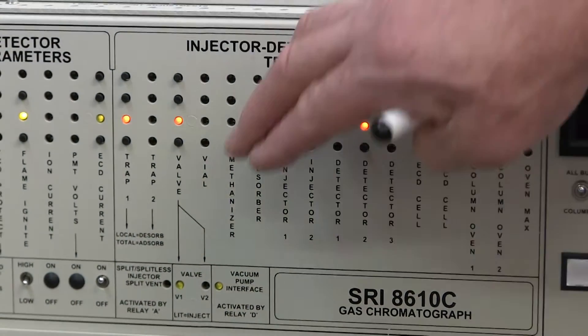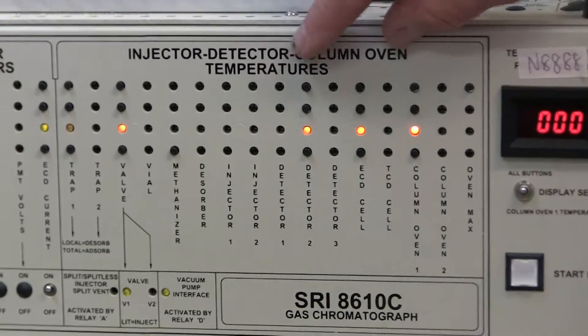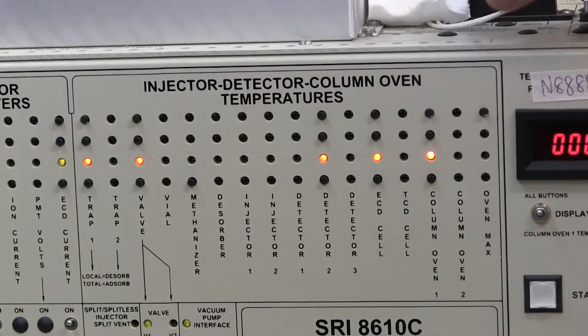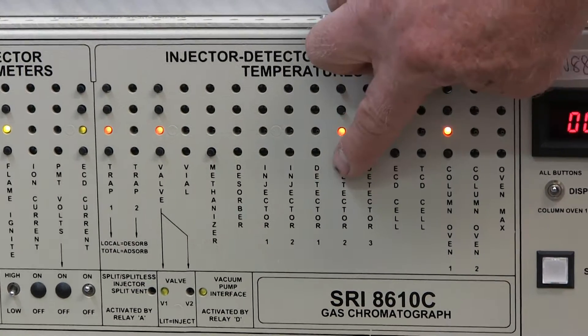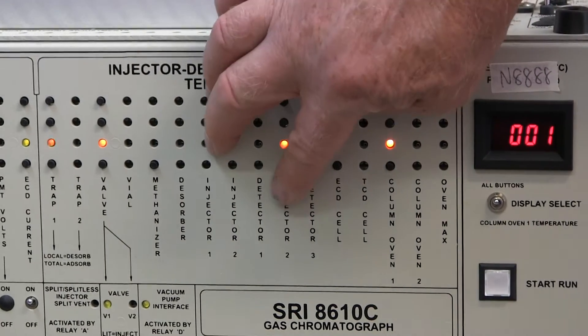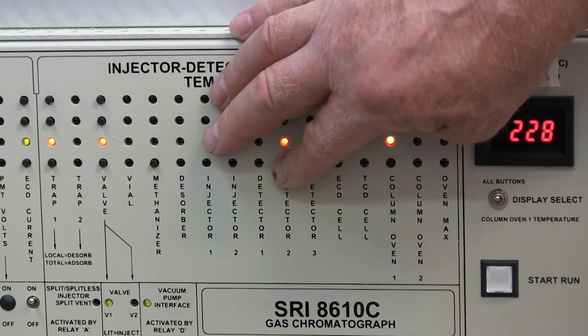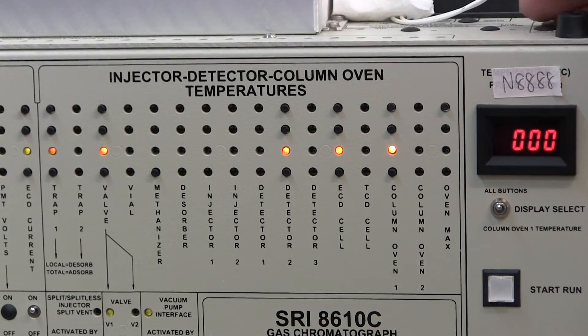This GC has a detector temperature associated with the FID detector in position two. The set point temperature is 300, the actual temperature is 229. So it's not quite at the set point temperature yet, but it will be as soon as it heats up.